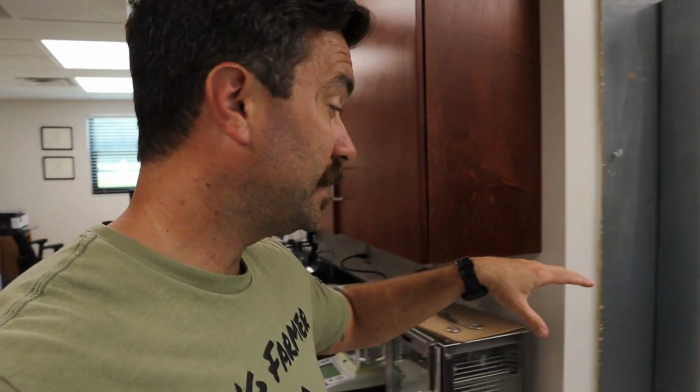Alright, Turd Nerds, it has been just over an hour. Our sample should be done drying. We're going to pull it out of our laboratory oven, and then we're going to place it in our desiccator for the 15 minutes. We're going to let it cool in that moisture-free environment before we put it back on the balance to get that dried weight. So let's open up the door and grab it out of there.